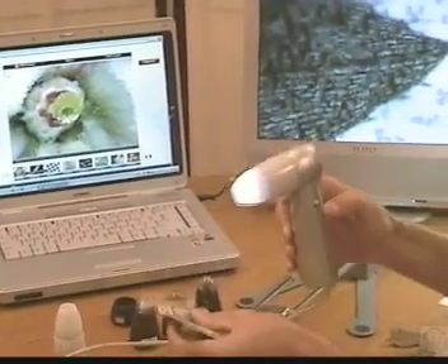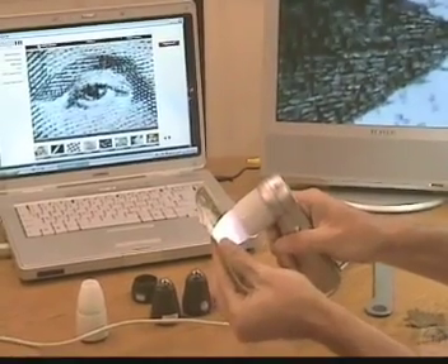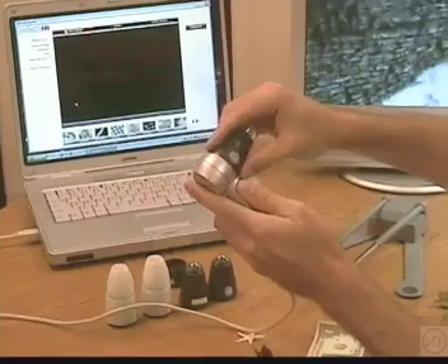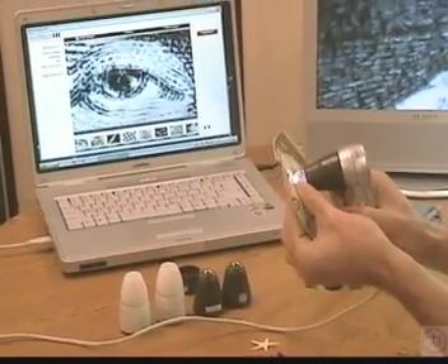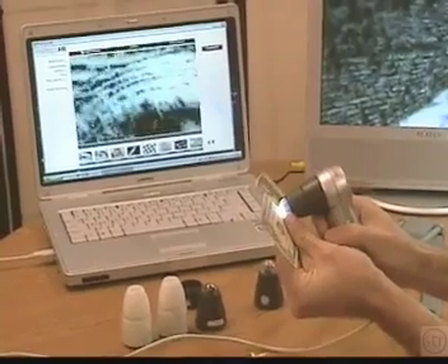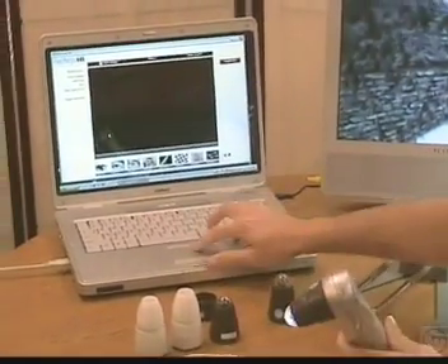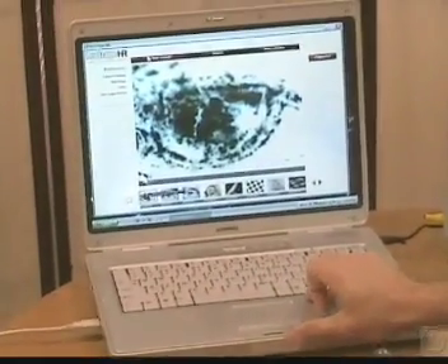I'm going to take a picture now of George Washington's eye on the surface of the dollar bill, and I'm going to change lenses to the 100x lens and take a picture again so you can see the difference in the magnifications available. Here's the 100x lens of the eye, and now I'll go to 200x and take a third picture. The highest lens available is 400x for both this ProScope and the Scope on a Rope. So now we can take a look at all three pictures: 50x, 100x, and 200x.